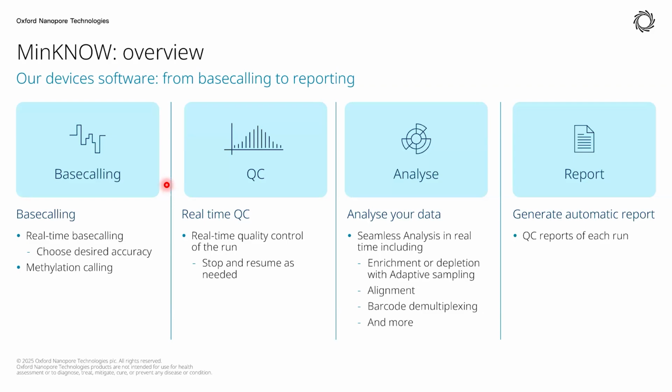at different stages, from base calling, including methylation calls, to data analysis, including quality control steps, and in addition generates a report at the end of the run, like the sequencing report, which we are seeing at the beginning of this talk.